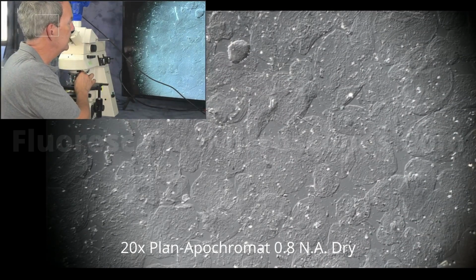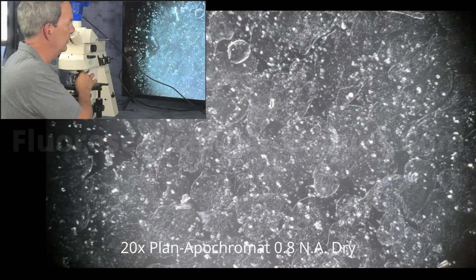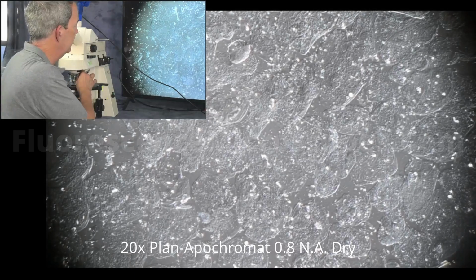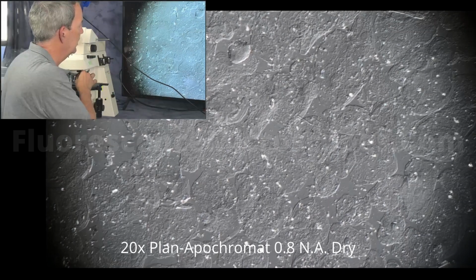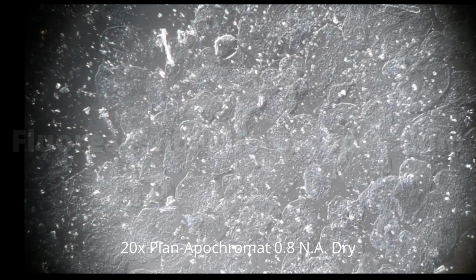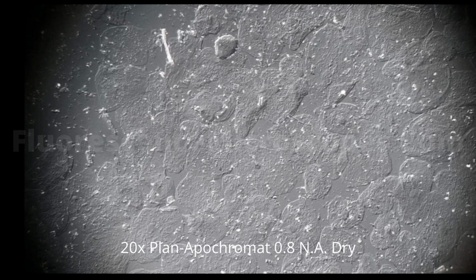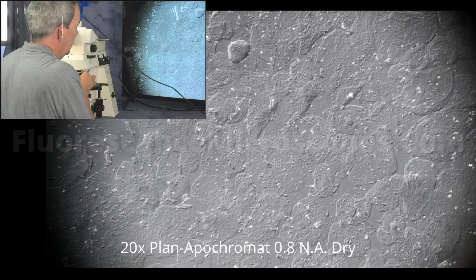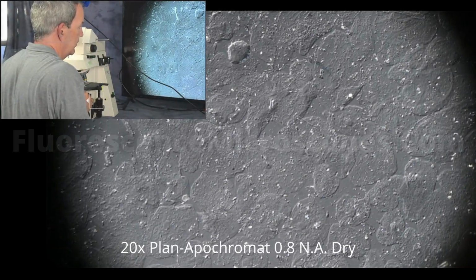And I'm going to adjust the shear plane. I'm going through a pseudo dark field, going from a positive. Here's a negative bias at this point. And I'm going to turn it back the other direction. Just a little more. Got a positive bias. We can see the nuclei here of the cells. And I can do some other adjustments to get my contrast increased.